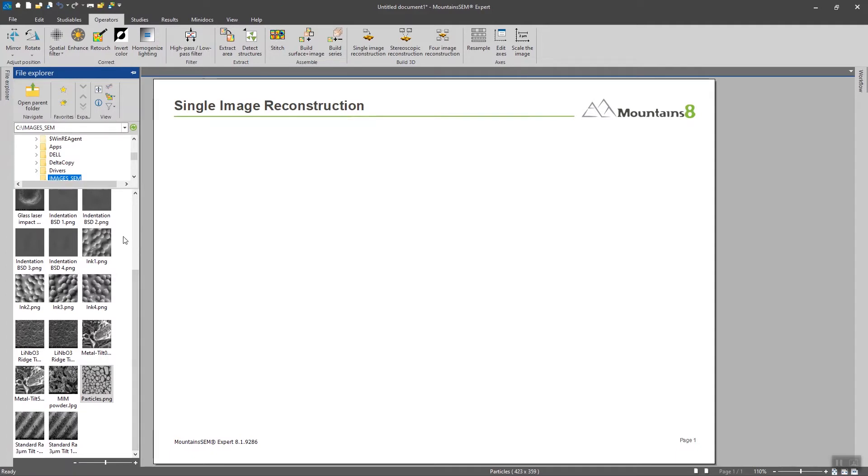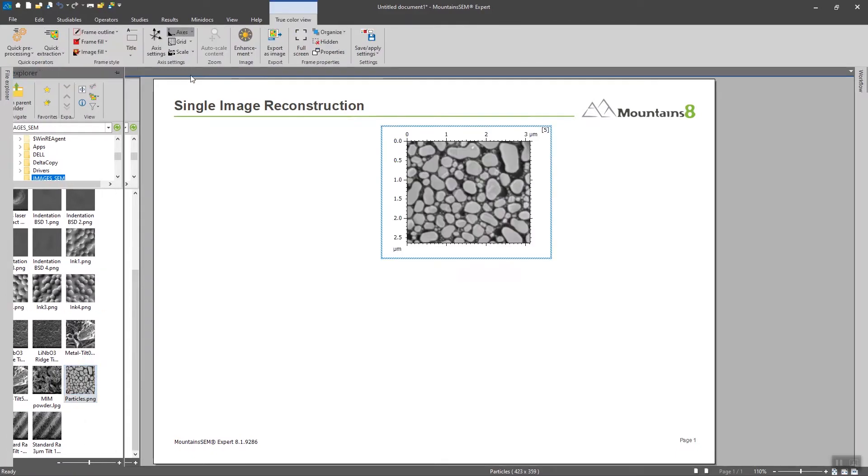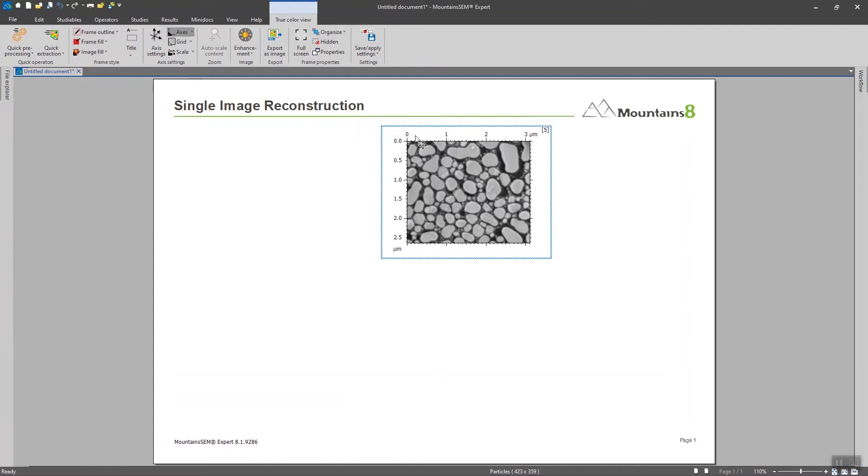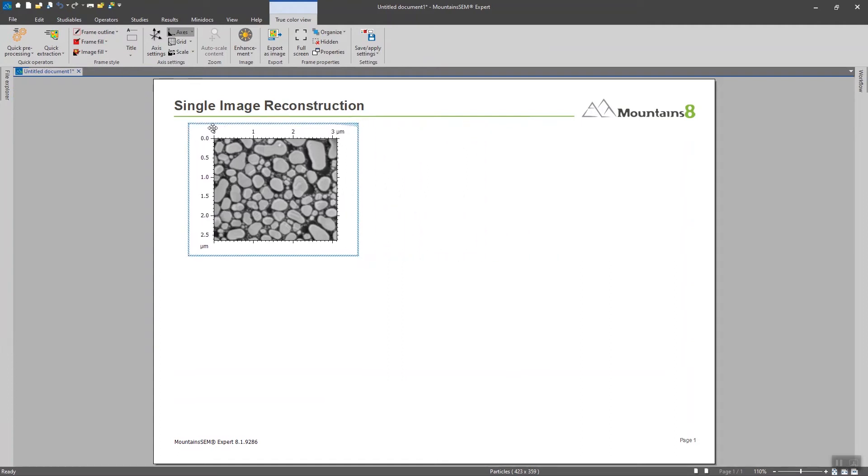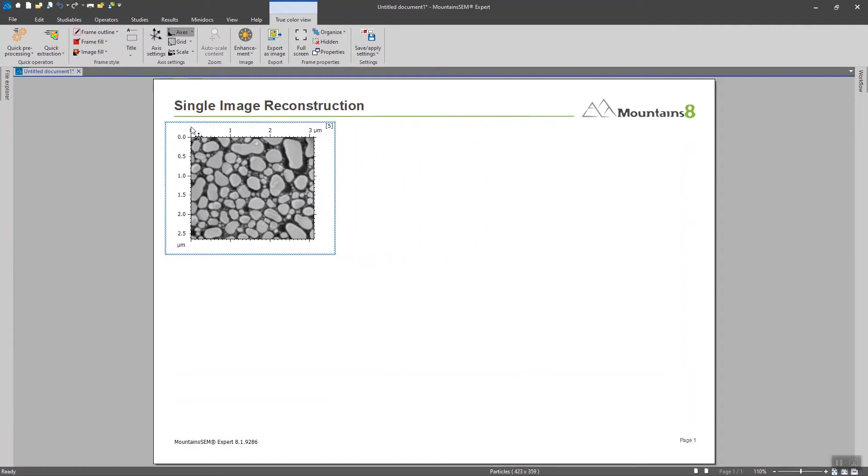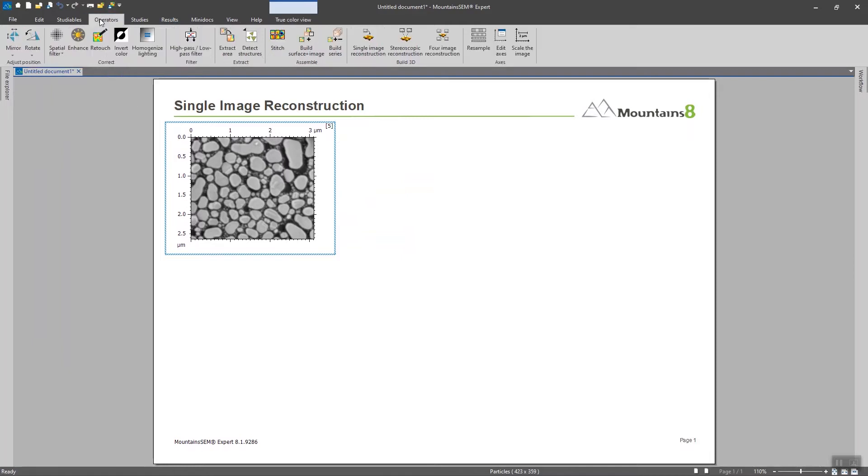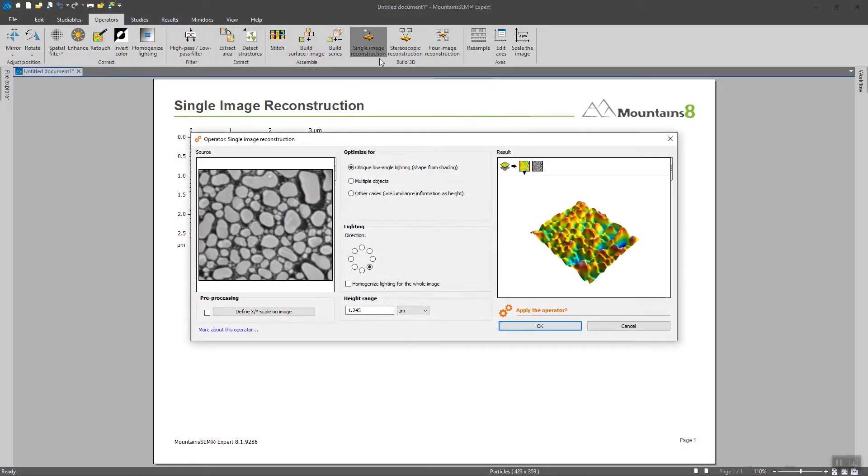So we are going to explore a few tools together and the first one is going to be the tool to use luminance as information. So again we are going to go to operators and click on single image reconstruction.